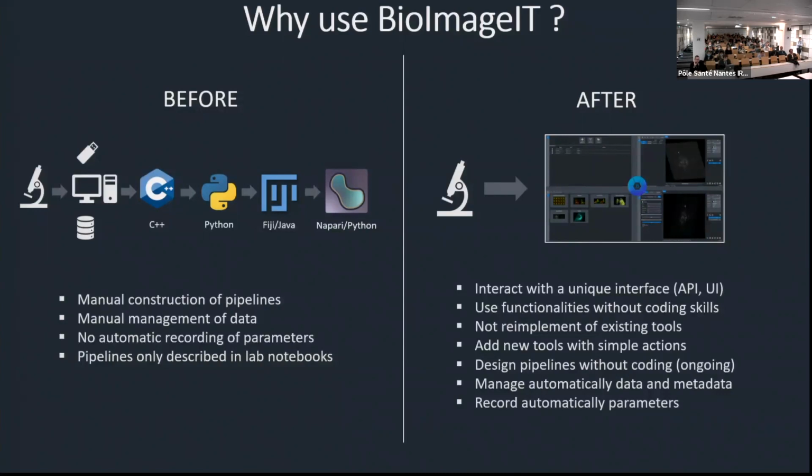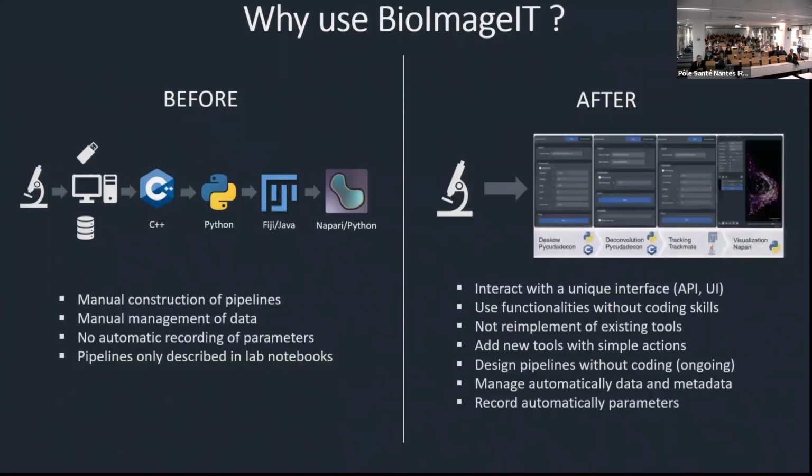The idea is also to design your own pipelines without any coding. BioimageIT manages automatically the data and the metadata, and also records automatically the parameters. To do a parallel with this example, you can do all of this within the BioimageIT interface. You don't have to jump between several softwares.